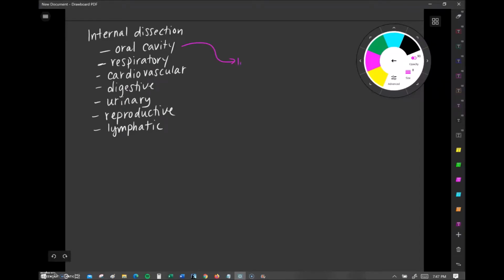All right, we're going to start off in the oral cavity. First, we're going to look at the lingual papillae. These are sort of the taste buds and modified taste buds. We have the filiform papillae, the foliate papillae, the fungiform papillae, and the valate papillae that we'll see.